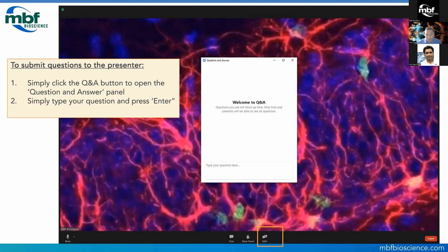Yeah, for multi-channel imaging, we do need to collect them sequentially, but we typically utilize multipass filters, so that the switching is really a matter of changing the excitation wavelength. So we try to maximize the switching speed by rapidly switching the excitation lasers.